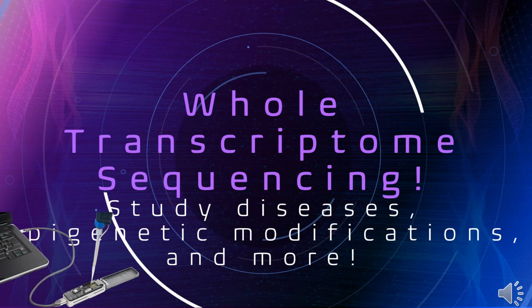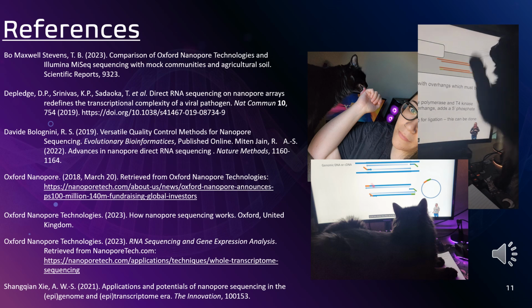In conclusion, direct RNA-seq is an important technique that can allow for whole transcriptome sequencing. High-output sequencing of whole transcriptomes can be completed from low input amounts and give you full-length transcripts at the isoform level. This type of technology is extremely useful in studying the cellular mechanisms of pathogens, cancer, and the effects of epigenetic modifications like methylation on genes. If you want to look at what the cell is currently doing right now, consider direct RNA sequencing.